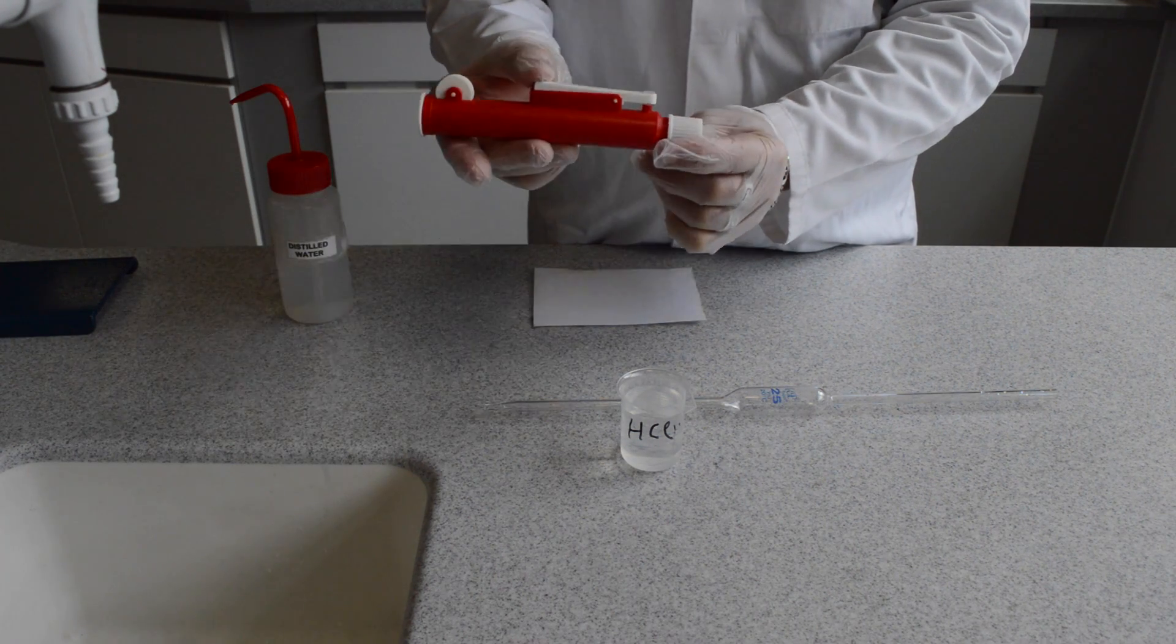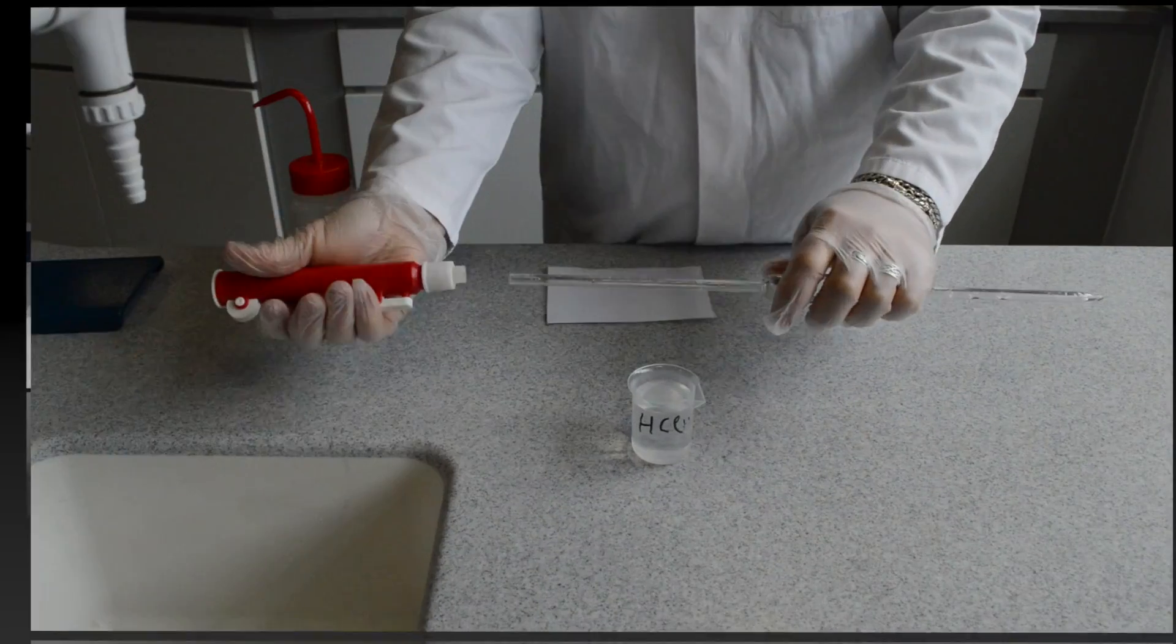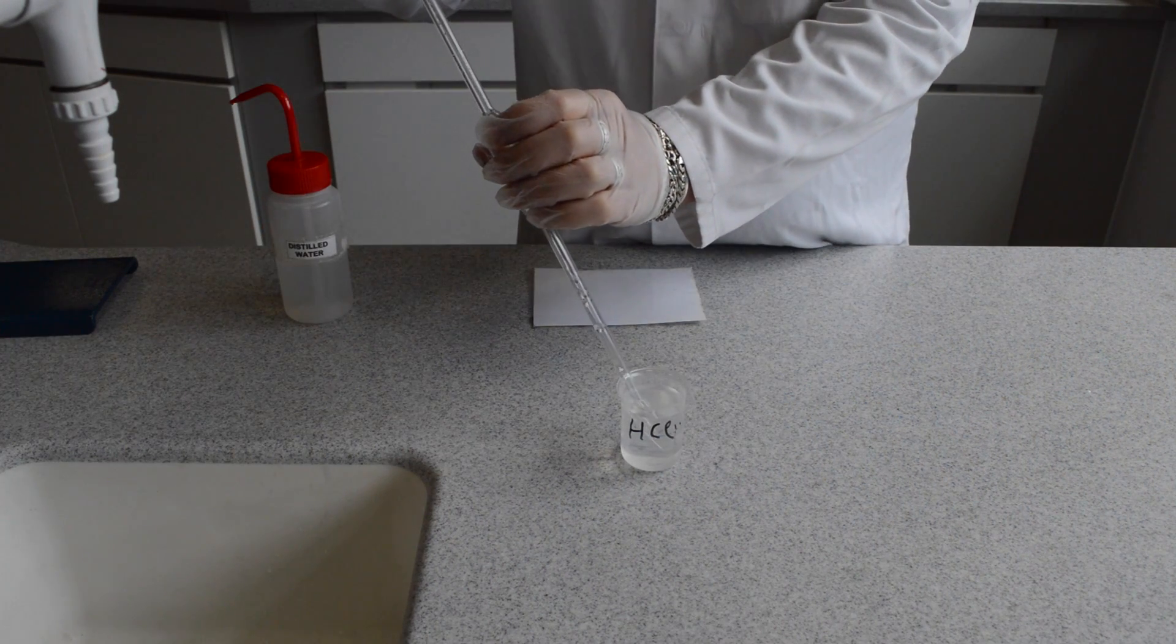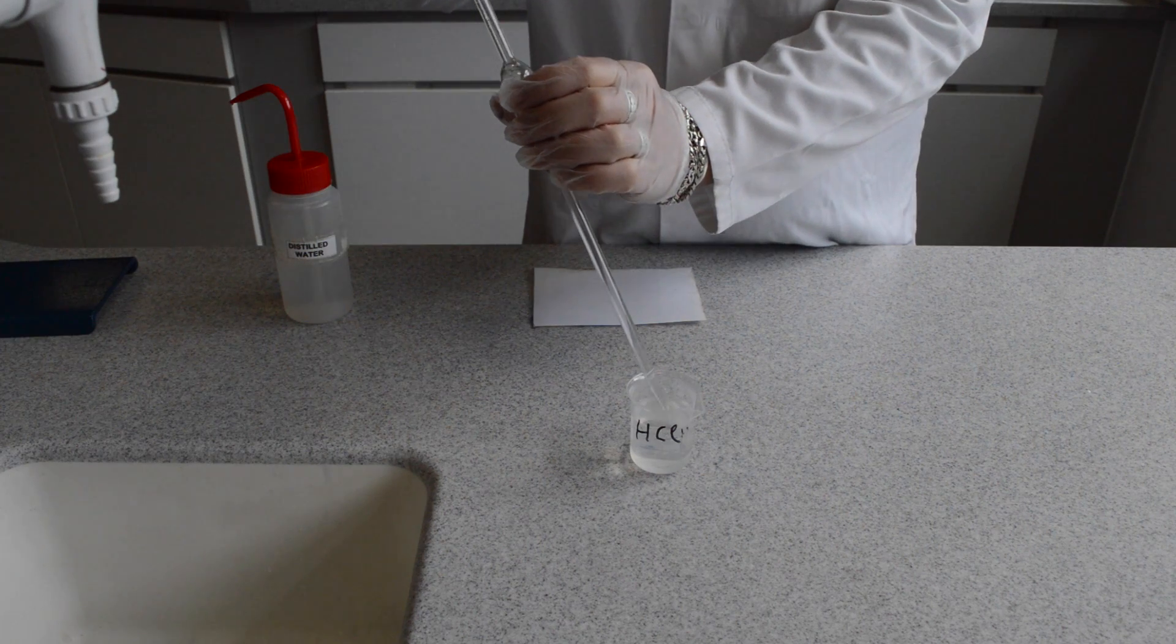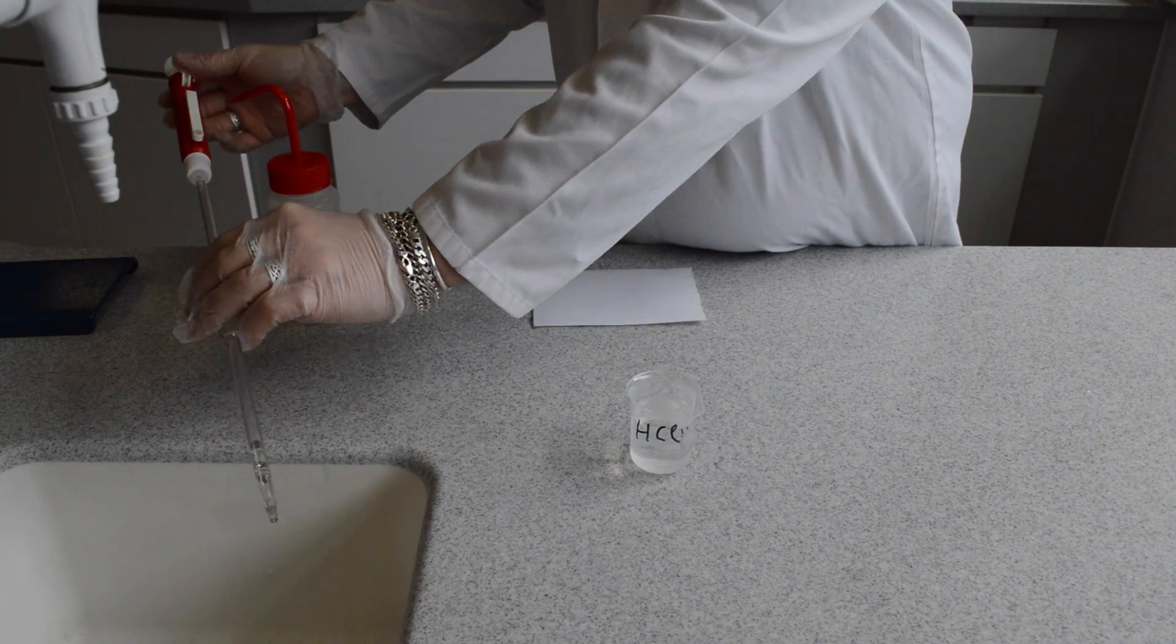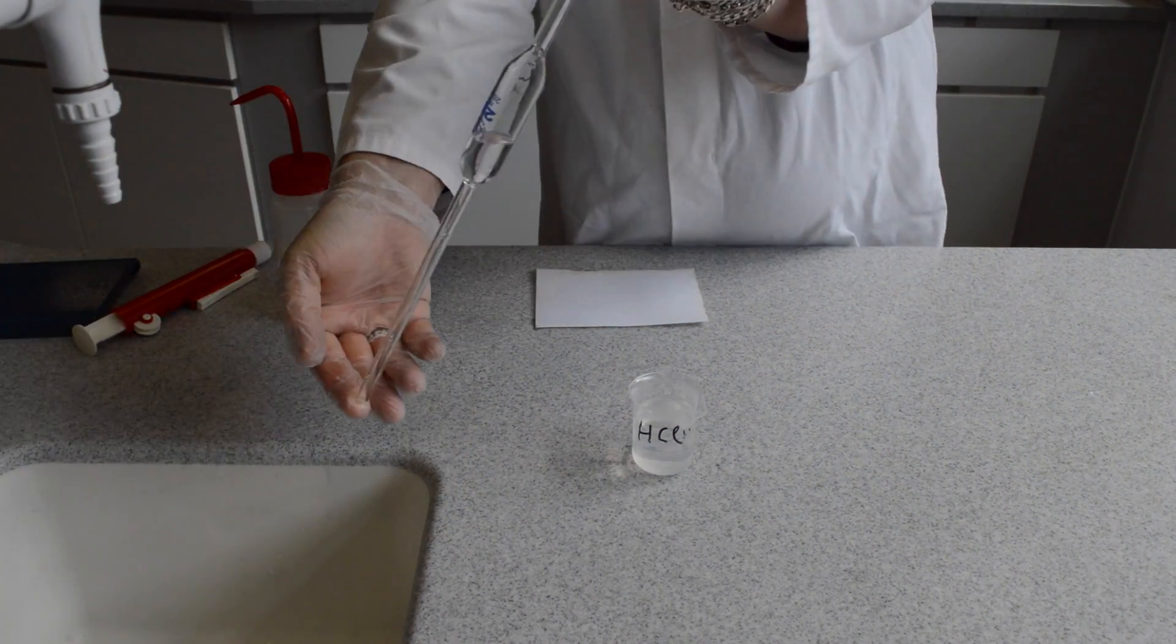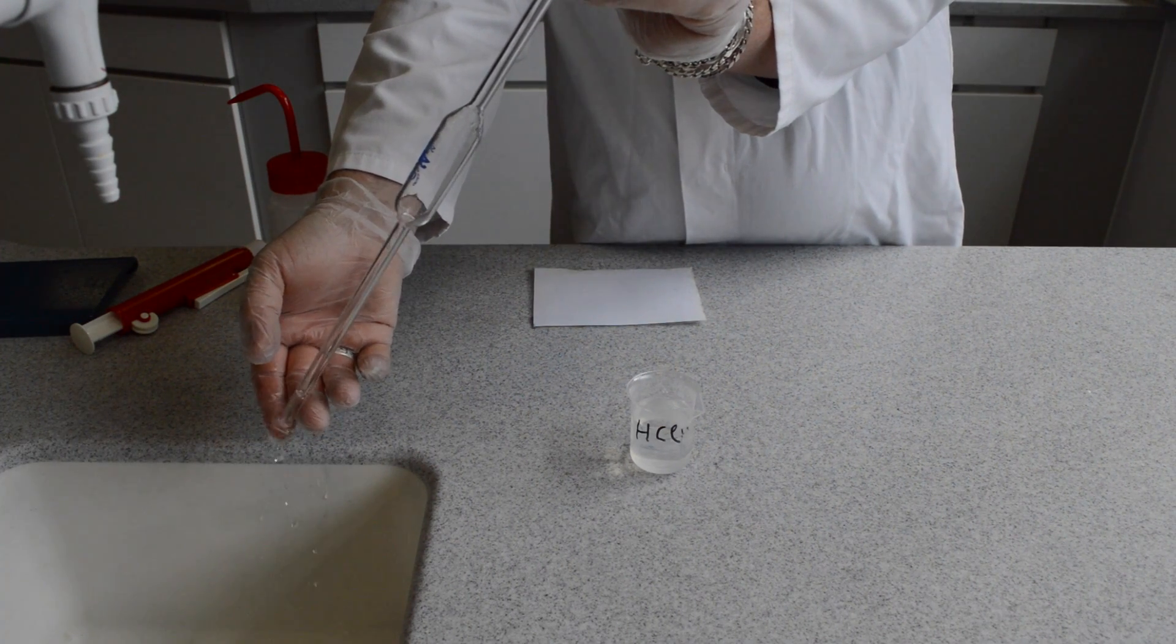As part of your conditioning of your equipment, you need to run some hydrochloric acid through the pipette. This is part of the washing and conditioning process, not part of your titration. Half fill the pipette with some hydrochloric acid, block off the end and tilt the pipette so that the acid washes the entire of the pipette inside. Then discard the acid.